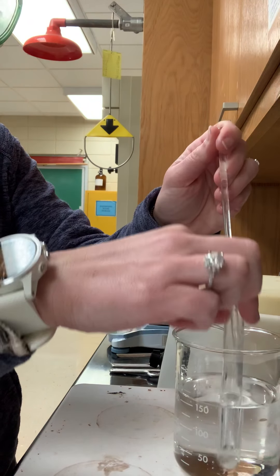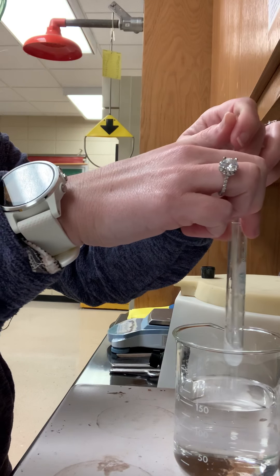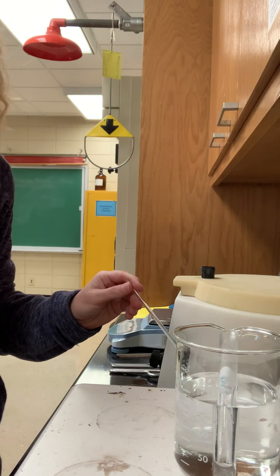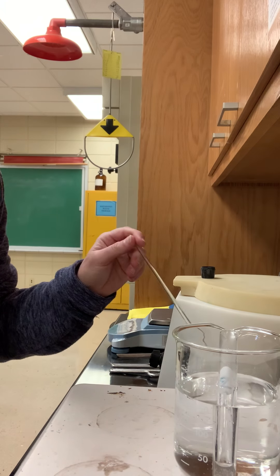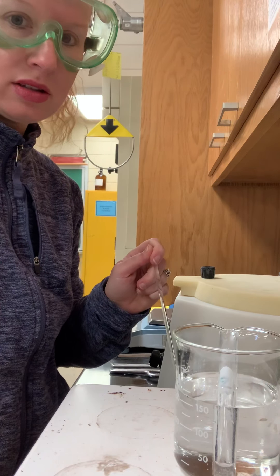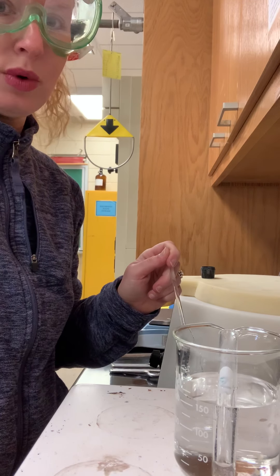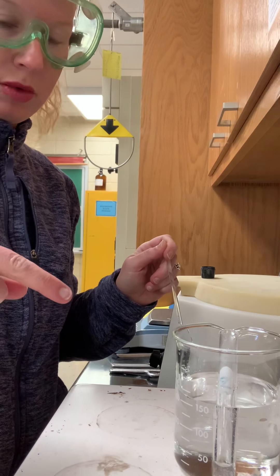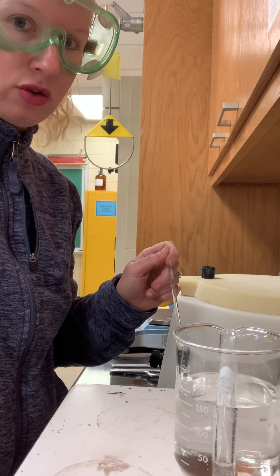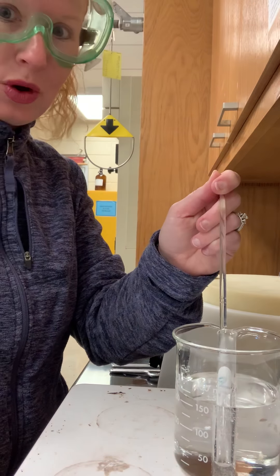You've got to read ahead in the procedure to make sure you know what you're doing, especially during some of these waiting steps, to keep you from making mistakes. It says centrifuge it after we're done with this, and then we're going to quickly transfer it into test tube three and add some sulfuric acid. I went ahead and got everything out and ready so when my three minutes are up I can centrifuge it — probably for about 30 to 45 seconds — then pour it off. These next steps are going to go real quick.